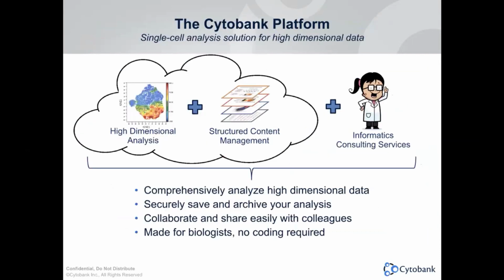So Cytobank comes in with a cloud-based solution specialized in high-dimensional data so that we can leverage cloud computing power for many of the algorithms we have in Cytobank. We also offer structured content management where you can securely save and archive your analysis.